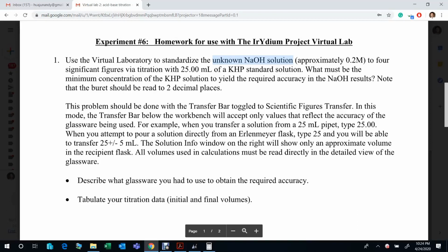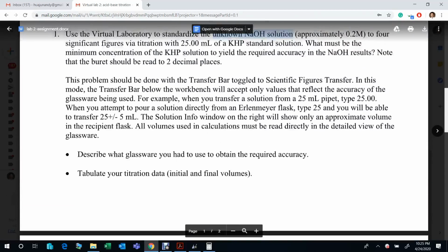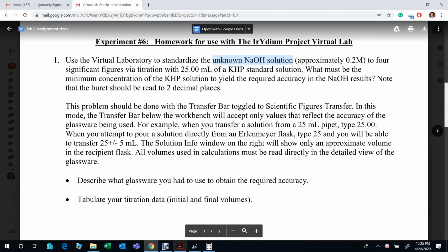You see, just now we recorded the initial volume is 6.9, right? And then the final volume is 12.51 or 12.50. And you can calculate the error is very tiny. So we don't need to worry about that. Okay, so we finished the first part of this experiment.